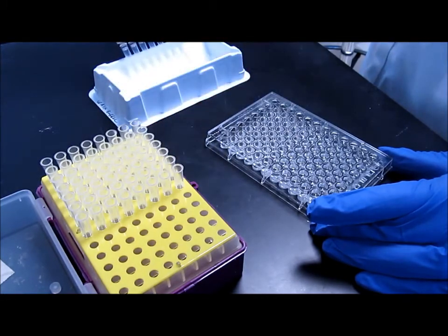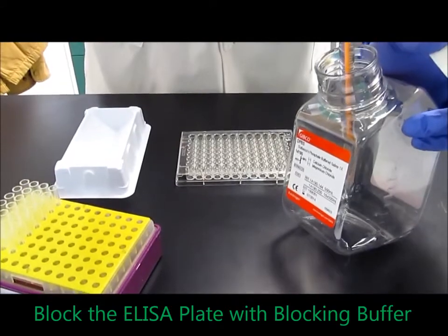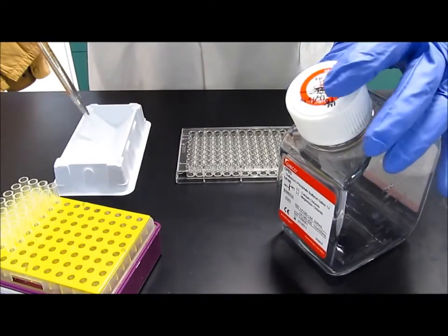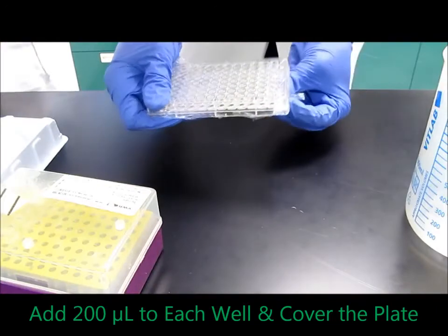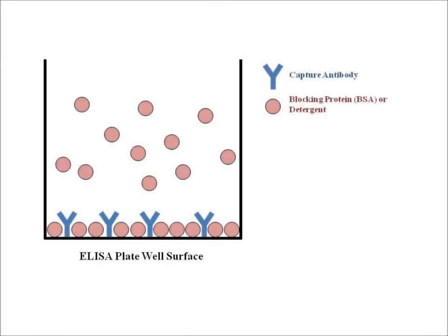After having washed away all of the residual capture antibody from the ELISA plate, the final step is to add the blocking buffer. The nice thing about ELISA is all of these steps are a little bit repetitive. Just like we put 10 milliliters of PBS into the reservoir when we made the capture antibody, you're just going to take blocking buffer, put it in the reservoir, and pipette into each well, and then wrap it in plastic wrap. You can put it in the refrigerator overnight, or you have the option of leaving it at room temperature for 2 hours, and this is sufficient to allow the blocking buffer to fill up any remaining space between the capture antibody.